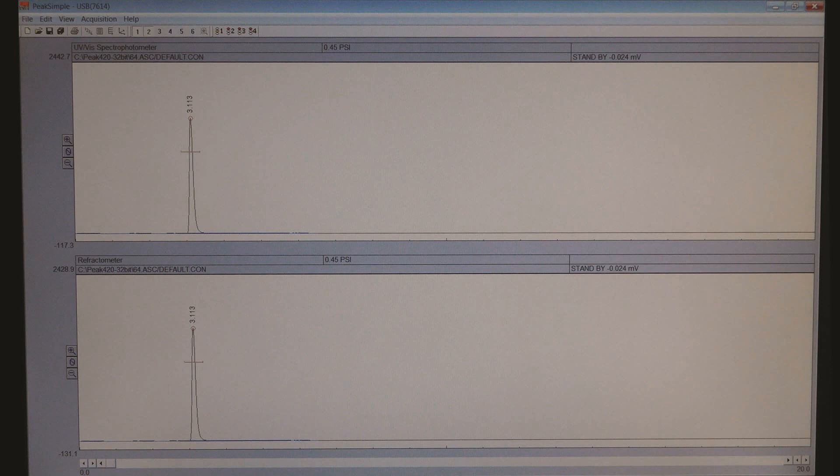When each of the detectors has returned to the baseline, and is no longer rising, you can go to acquisition, and stop. This will stop the instrument, and complete the scan.